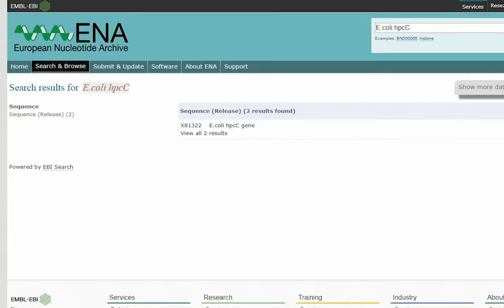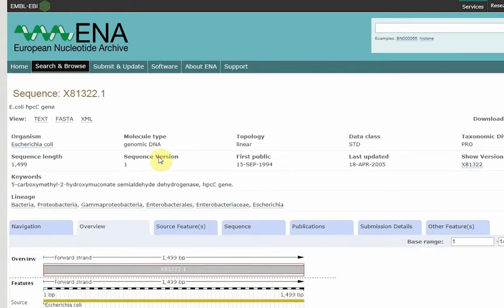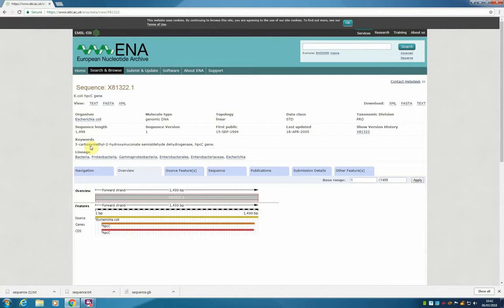And here it comes back with two results. We are going to click on this link. And here we have a similar entry to what we had before. Don't be confused about the different layout, but all the same information is here.